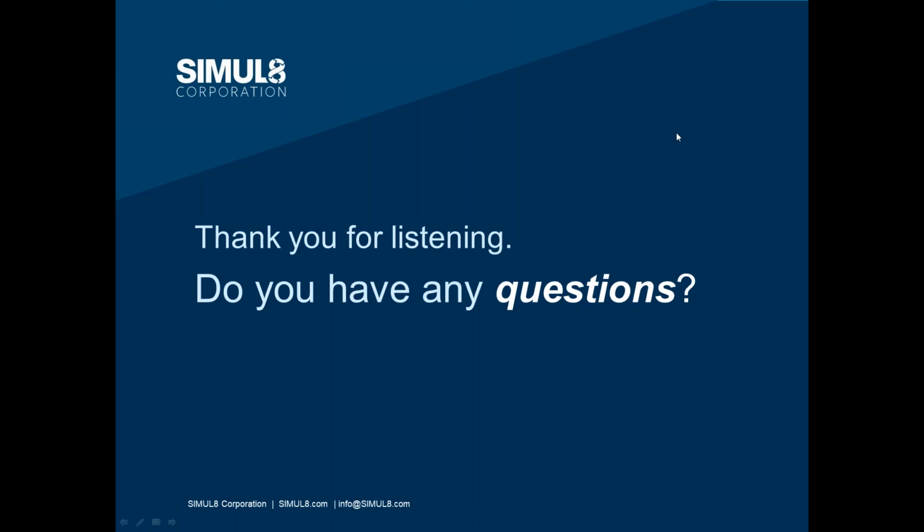Yeah, it does vary quite a lot. It depends what you're trying to do. If you're building a whole new lab with a whole new layout, it's going to take longer than if you're building a system where you've already got the system and you're just testing out a few different machines in different configurations. You can build a lab flow and get results from it really quickly, within maybe half a day. But we have some projects where we're building these reusable components, where you might be working on them for a couple of months before you have the final polished version.